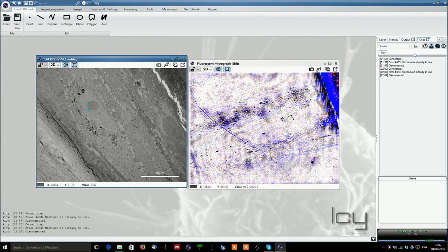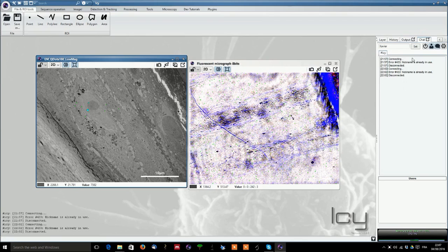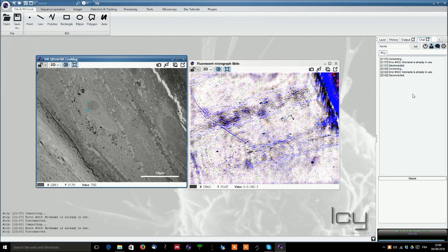Then last but not least, you have here a chat window in which you could connect and have a discussion with users. It depends whether or not some people which are aware of your plugin are connected and then they could help you to sort your questions.